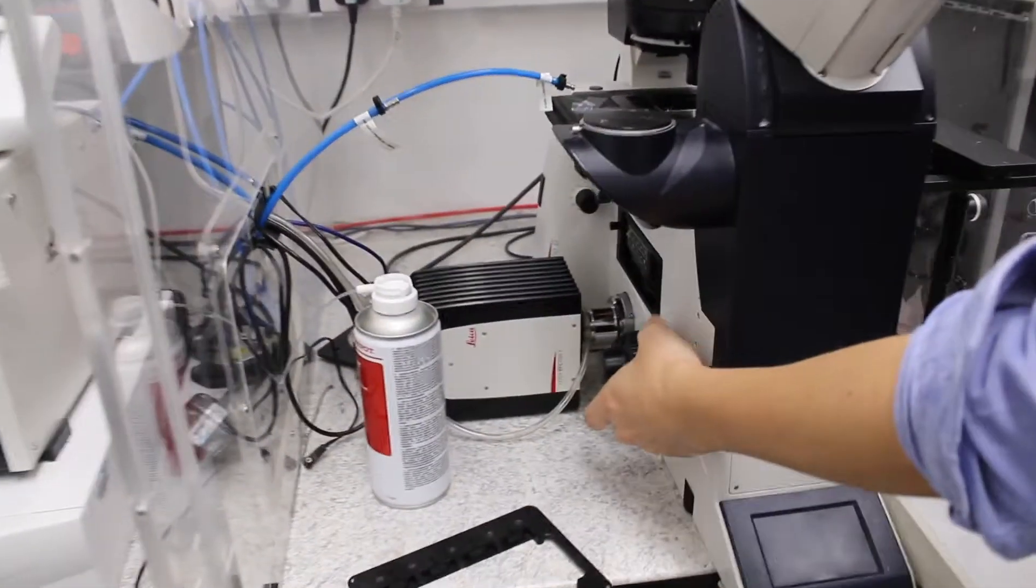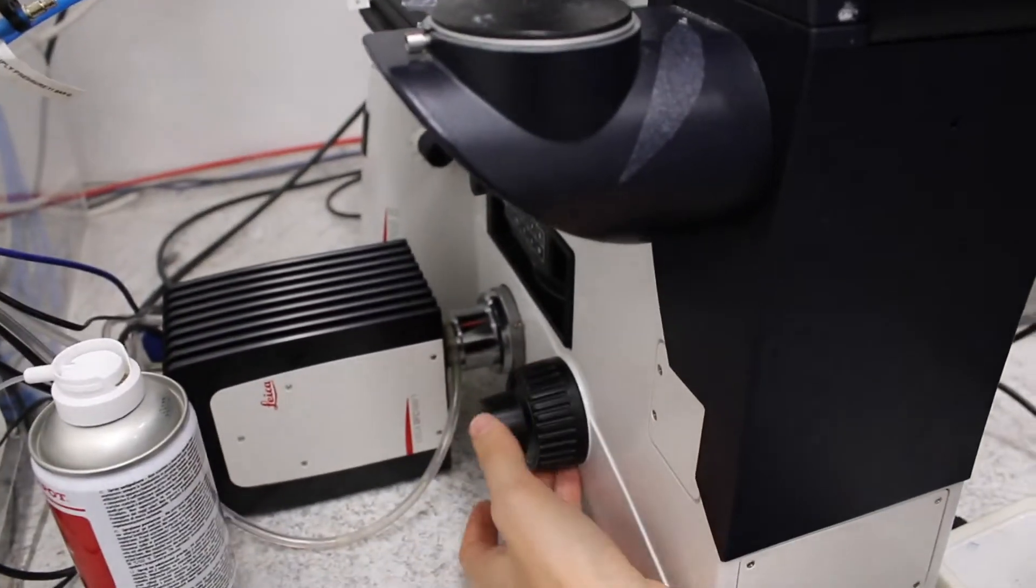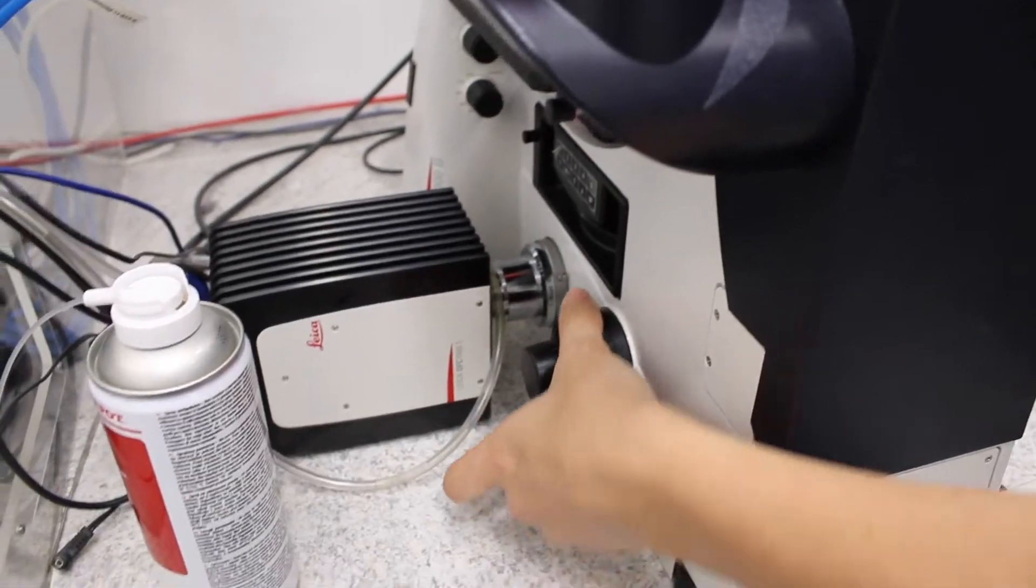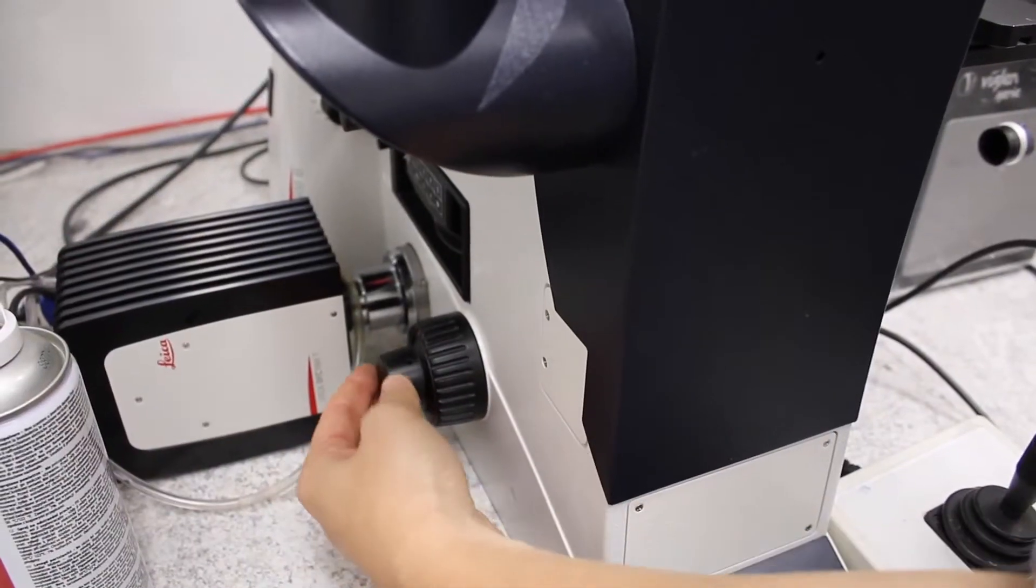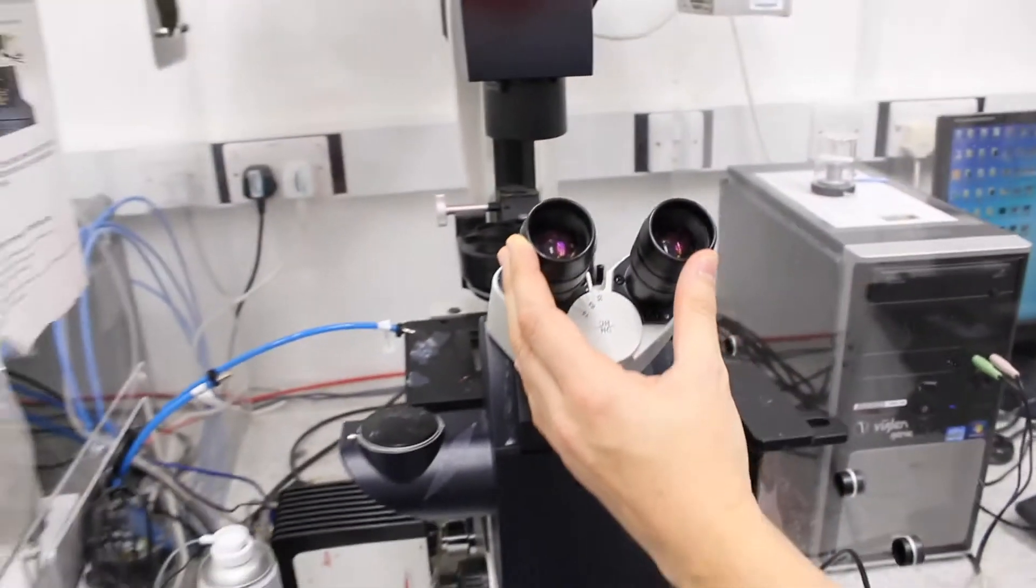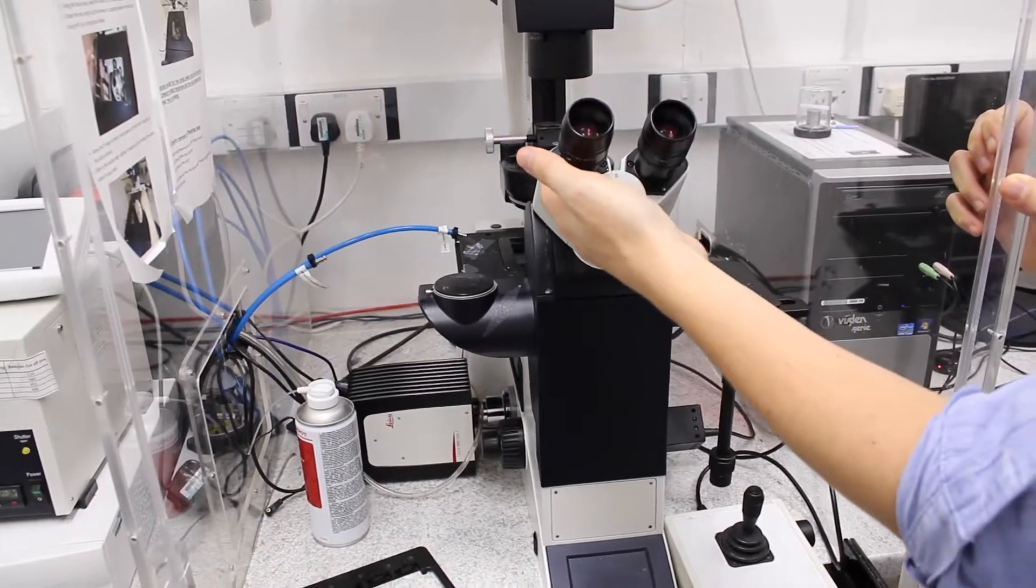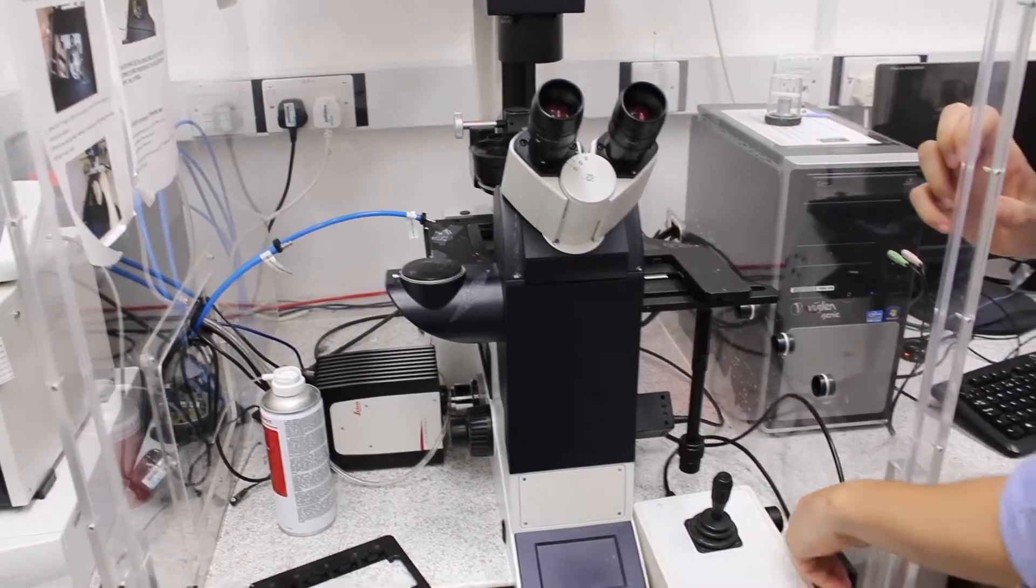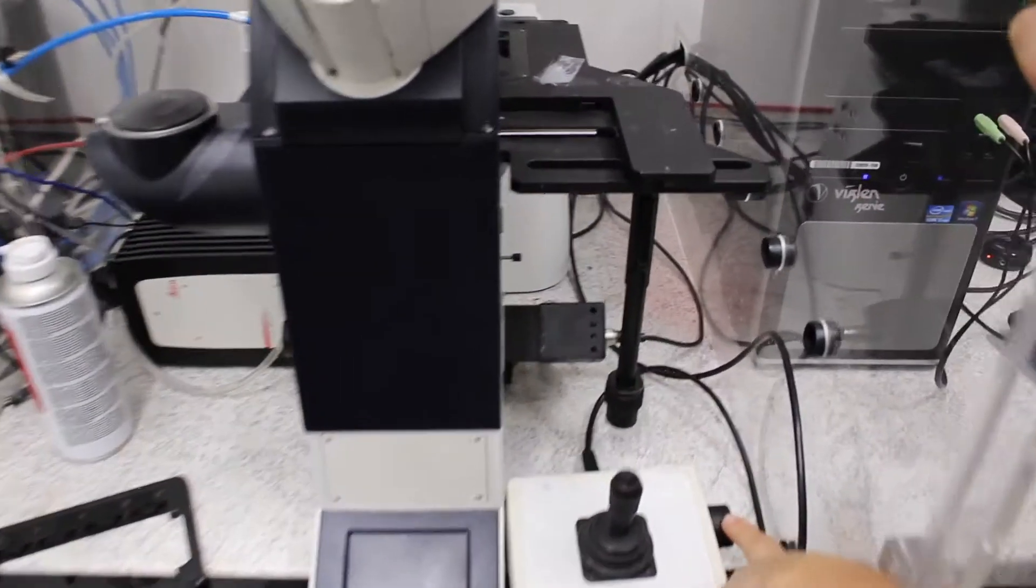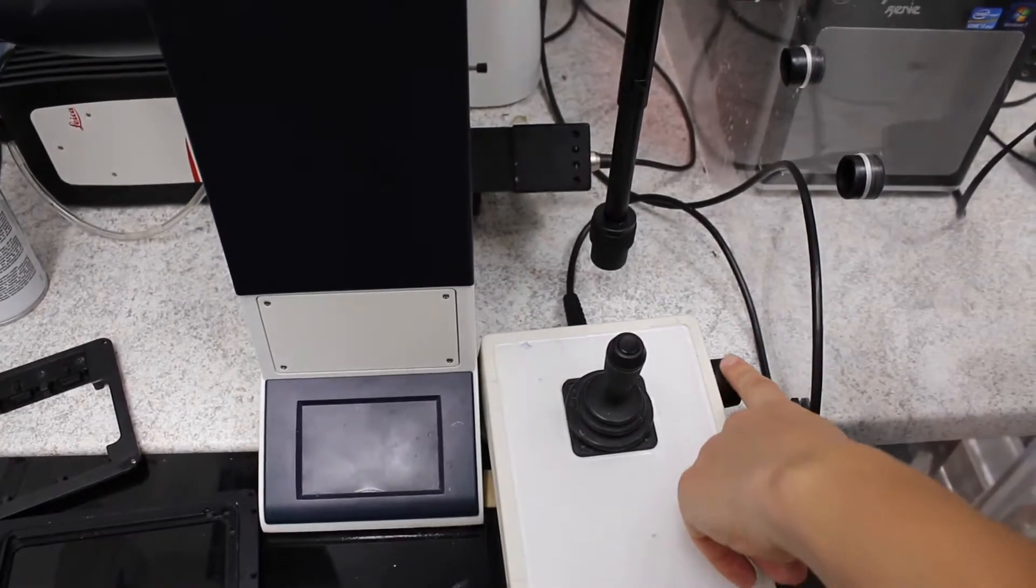And then you have to adjust the focus in your sample by using either the coarse wheel here, or the small wheel, and looking to the eyepiece to see when your sample is in focus. You can also use this fine wheel here, that will adjust the focus finely.